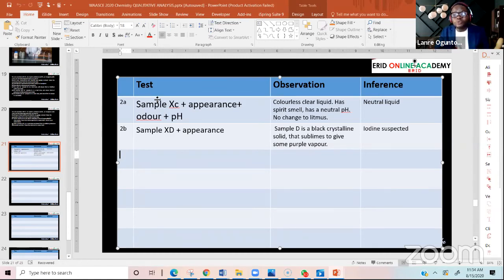So for question 2, if your solution is very dilute, it means your reaction will not happen very fast. In case your reaction is slow, and this is an exam where you have maybe 1 hour 15 minutes or 1 hour 30 minutes, if you put it in hot water, it will increase the rate of reaction. Please, everybody, hope you are hearing that. Somebody asked that question, and I think it's very important. Thank you, Indatu, for asking that question.